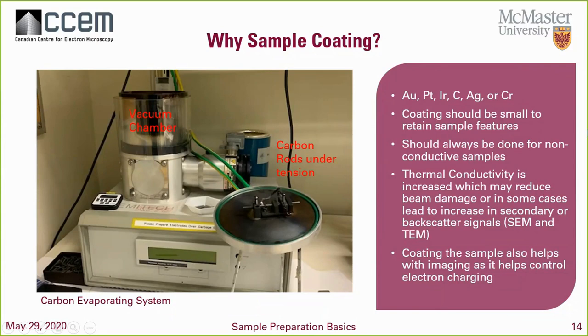Another reason why we coat is thermal conductivity, right? We want to increase, right, the signals that we're looking for, right? The secondary and the backscatter signals, that's one positive of conductive. And we also add a protective layer, right? Some of that coating is going to take some of that heat coming from our guns, protecting our sample, right? It will also help you with imaging, of course, right? Some operations, if you're experiencing charging, you might want to take out your sample from the SEM and TEM and consider a coating.